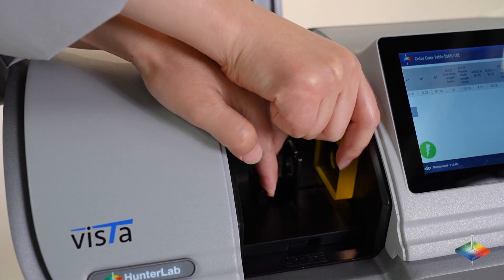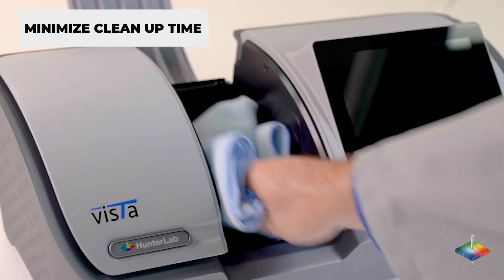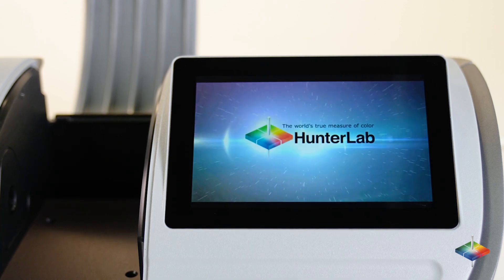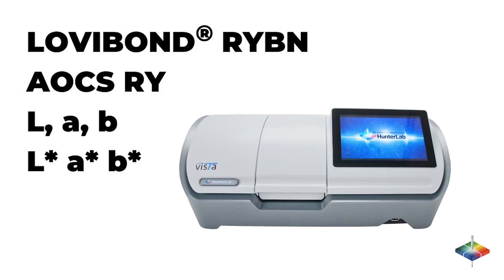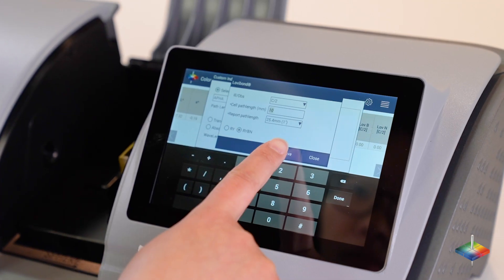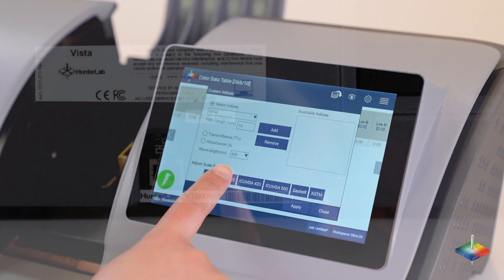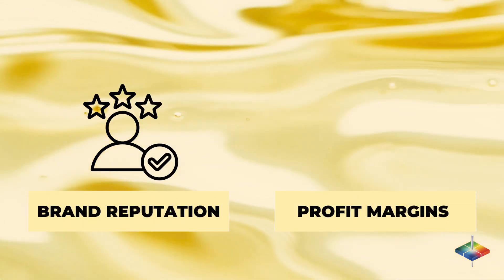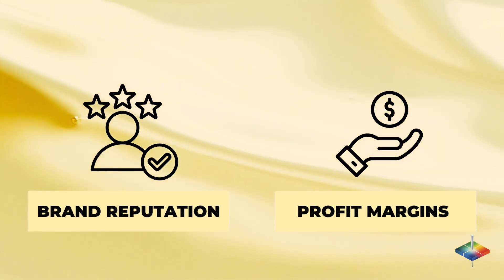Speed up your measurement process time while minimizing product waste and cleanup time. Hunter Lab makes your quality assurance process simple with all the pre-equipped color scales and indexes you need, an easy to use modern interface, and the latest data communication features. Rest assured, your brand reputation and profit margins will always be in check.